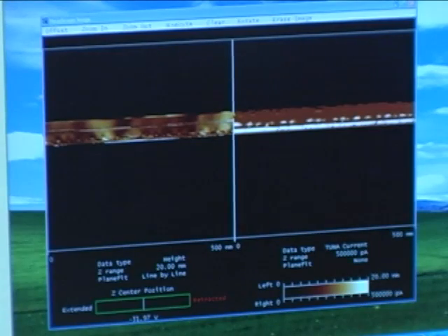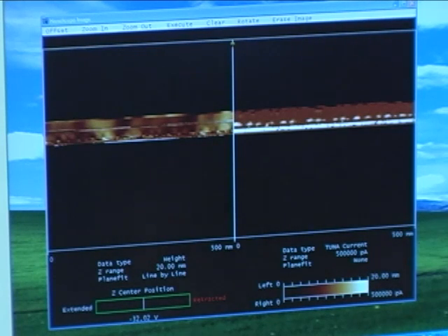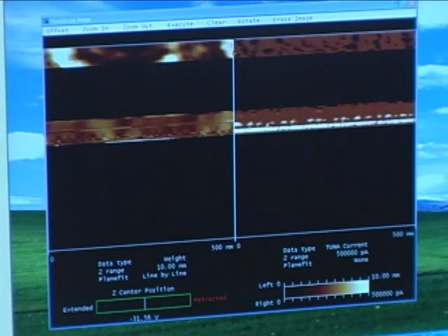I can set my microscope to start at the top of the image and begin obtaining data. The left-hand side represents topography or height. And the right-hand side represents current with, in this case, black being more current and the reddish-brown representing zero current.